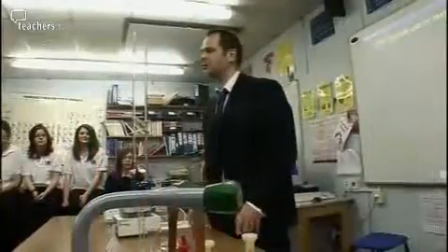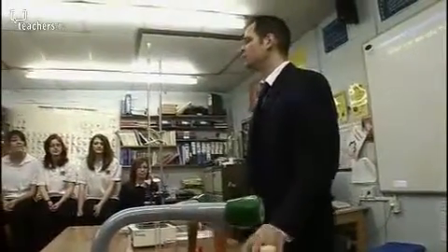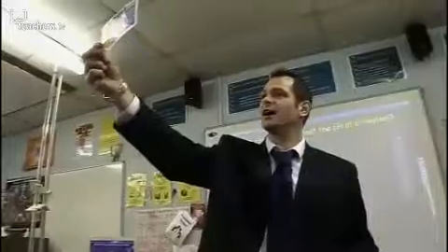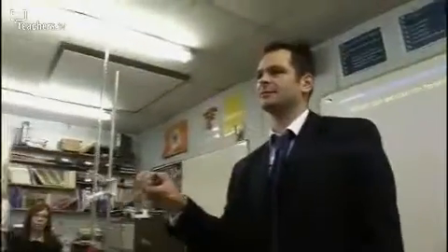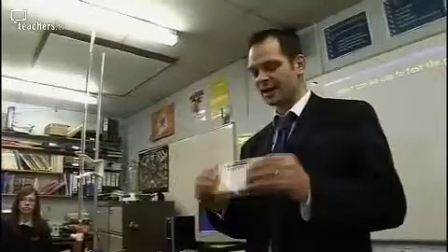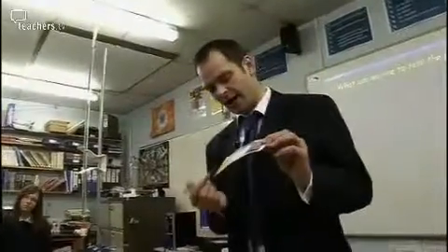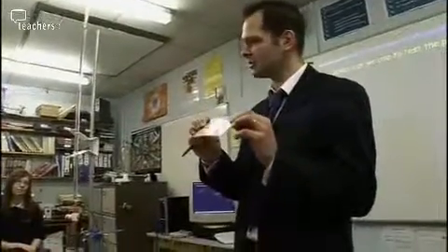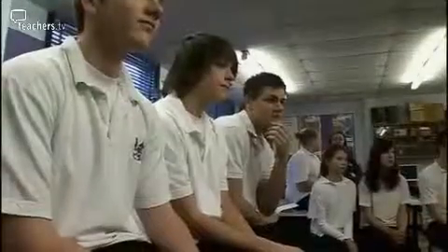You've tested pH before, haven't you? Yeah. What did you use? pH scale, fantastic. And we have all the different colours. How accurate is that? Not very. It's not entirely accurate because we have 4, 5, 5.5, 6. There are a few divisions here and there, but it's not entirely accurate for that reason. So let's think of a more accurate way to do it.